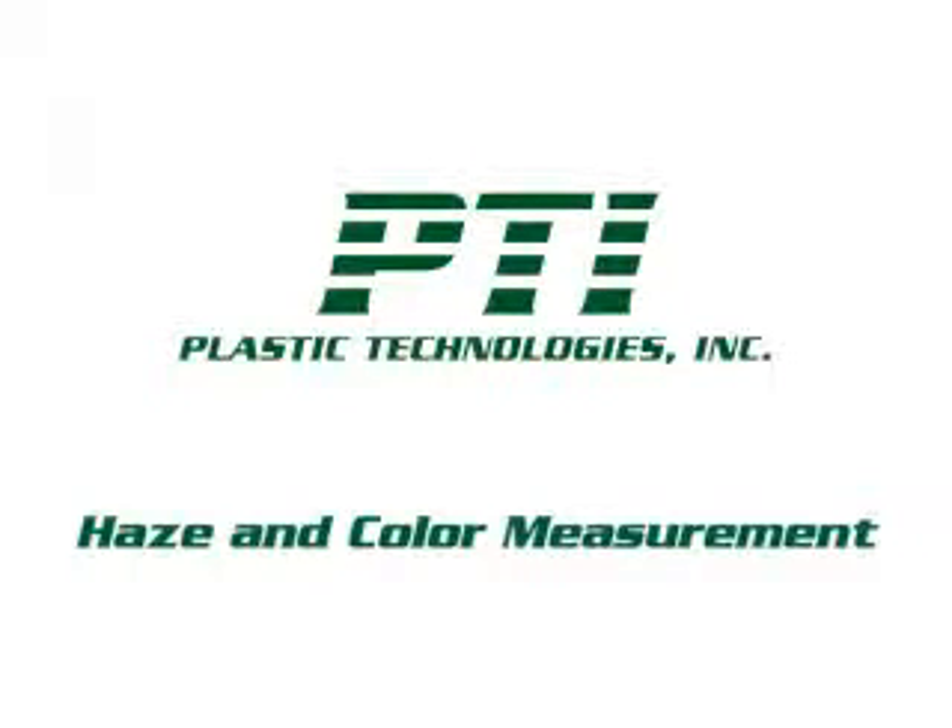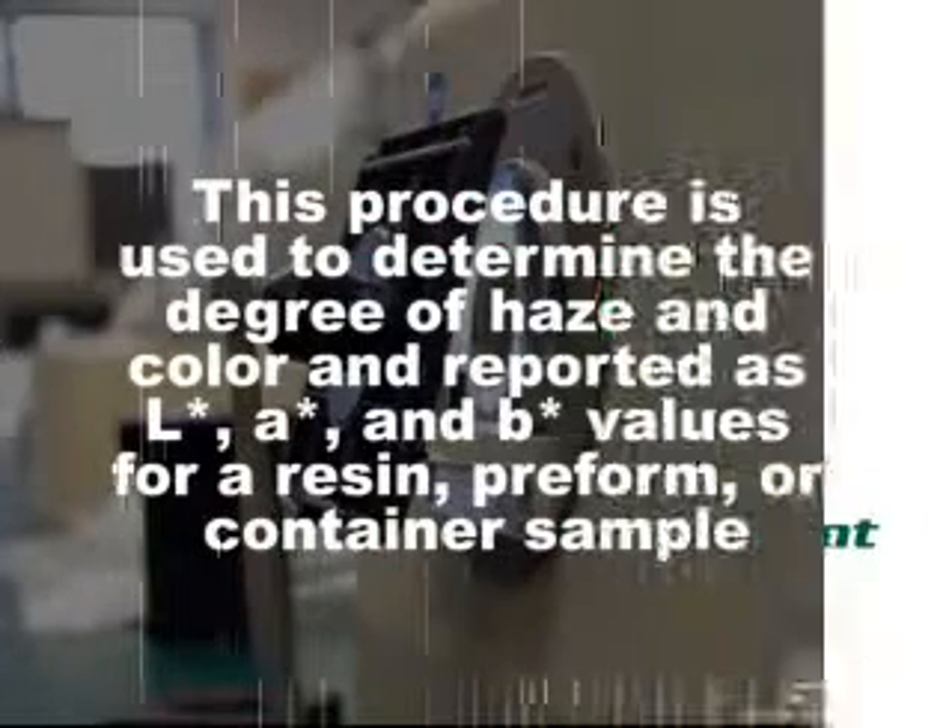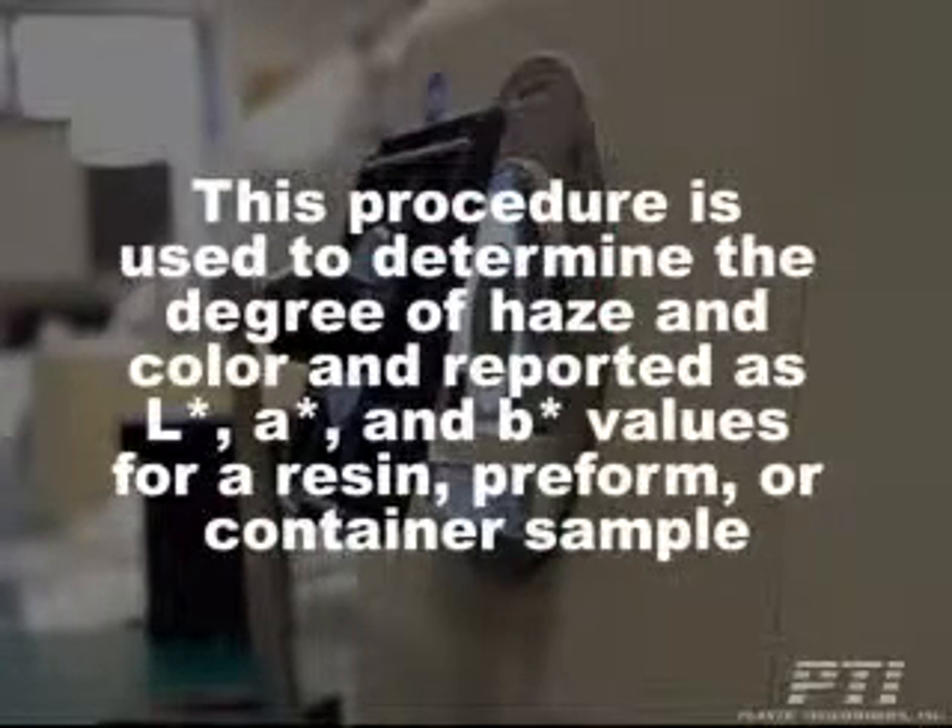PTI's Haze and Color Measurement Procedure using a Minolta Spectrophotometer. This procedure is used to determine the degree of haze and color, reported as L star, A star, and B star values for a resin, preform, or container sample.